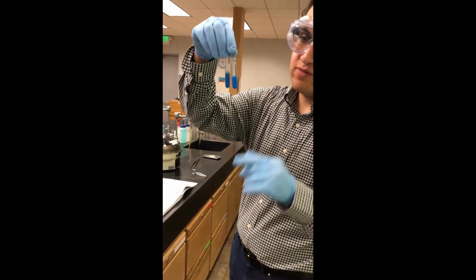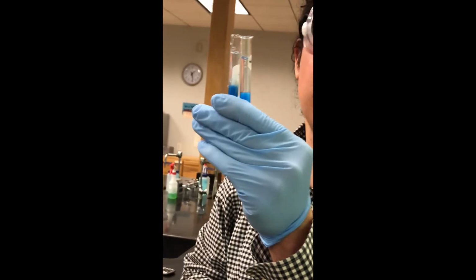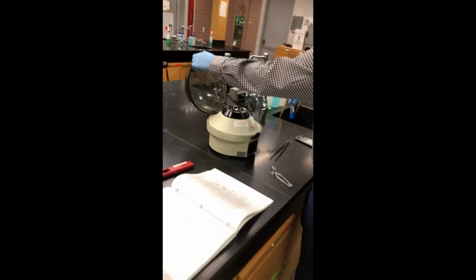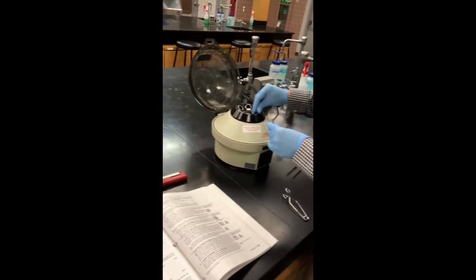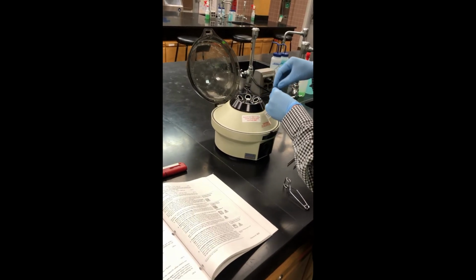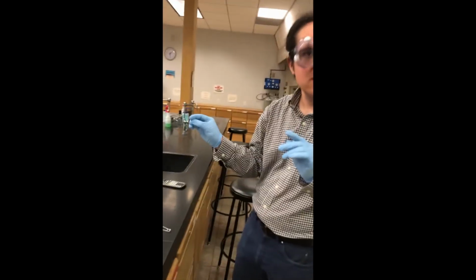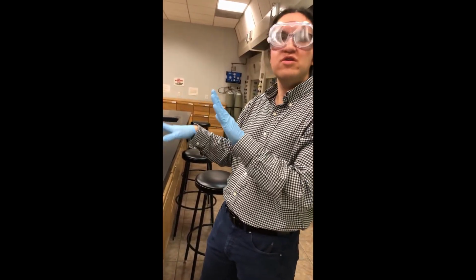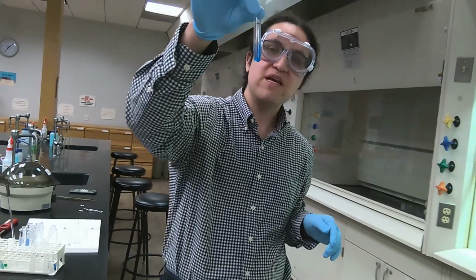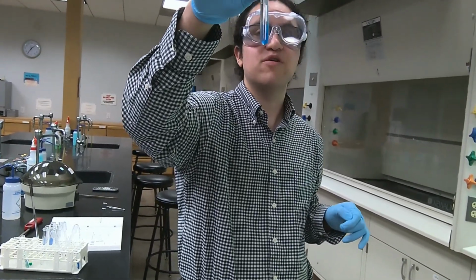The reason why I add a little bit of water to test tube 1 is you want to make sure your centrifuge masses are balanced. I'm now going to load each of my samples on opposite sides of the centrifuge. The reason why they're on opposite sides is so the load's balanced. Now we're going to pause and resume once the centrifugation is complete and I've run test tube 3 through the same procedure. Following centrifugation, we've separated out our solid copper hydroxide from our supernatant liquid.